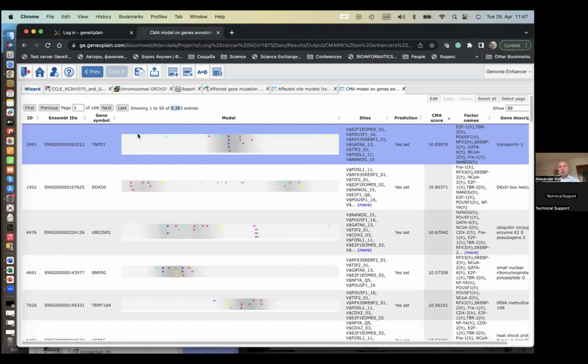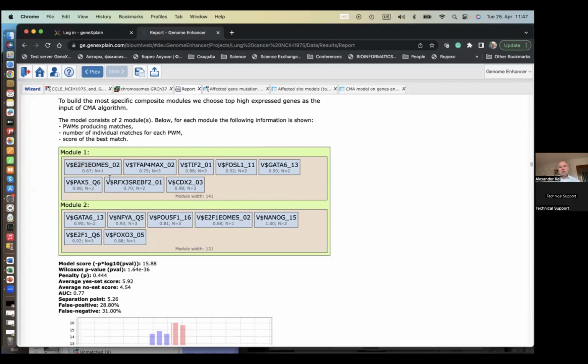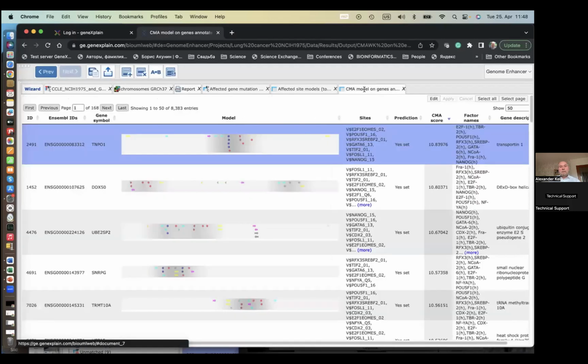So it's around 1,000 nucleotides upstream from the TSS, and then each of these little arrows is a predicted binding site for that cluster which I was talking about. So this is a cluster of positionally weighted matrices. We have here how many, 12 matrices, 13, and here we see the binding sites for those different matrices, and then you see how many of those matrices gave binding sites in that particular promoter, and it also looks for the clustering of those binding sites.